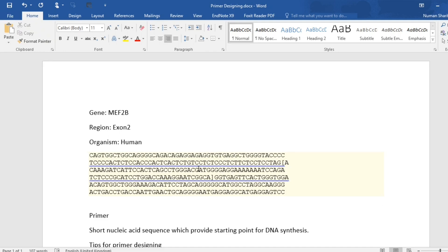So I have the sequence of exon 2 of MEF2B gene and I want to design primers for it, but before doing this let me give you some tips for primer designing.